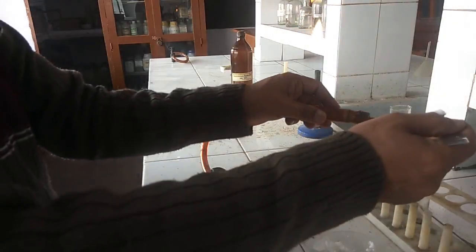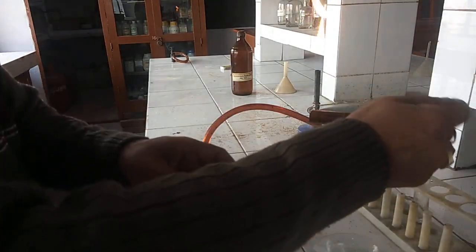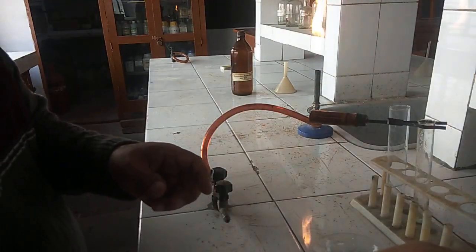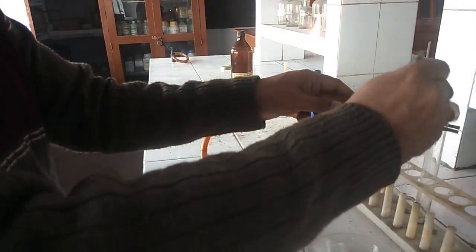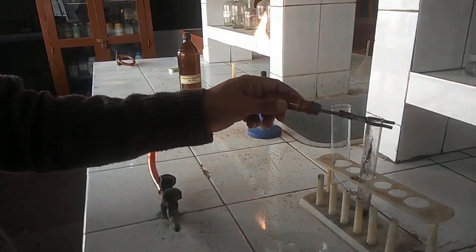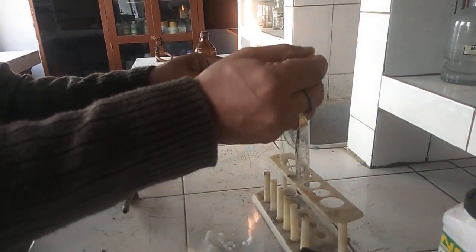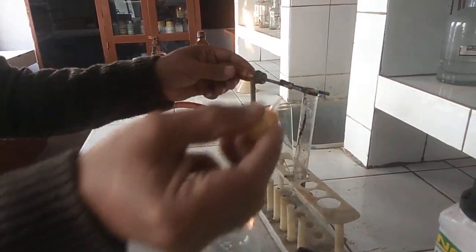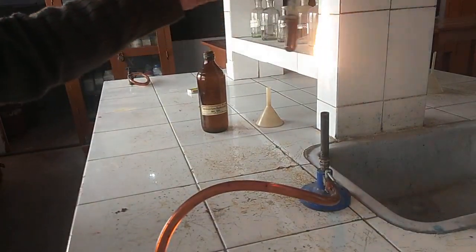Again we will take some salt in a test tube. Then we will add solid MnO2 to this. Now again we will add concentrated sulfuric acid to the test tube. We have to heat this content over a Bunsen burner.